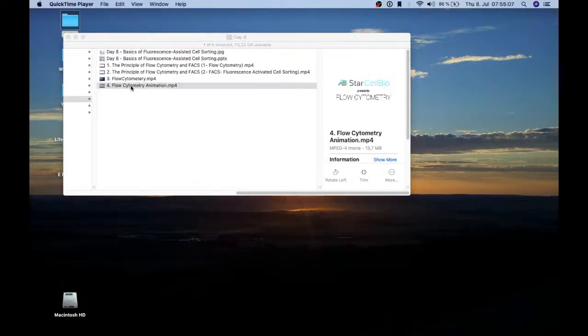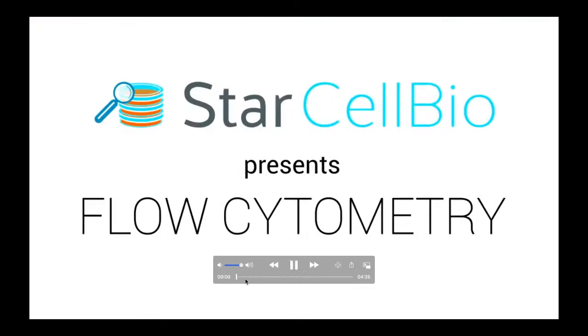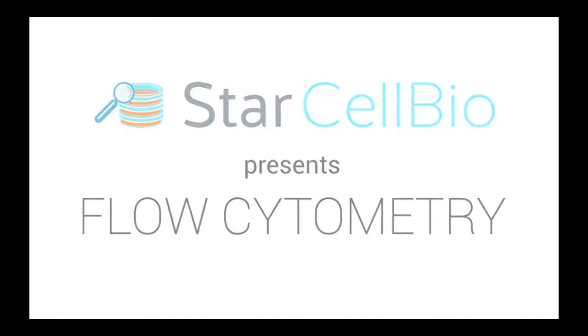Now that's the last one. In this animation, we will introduce you to the flow cytometry experimental technique.